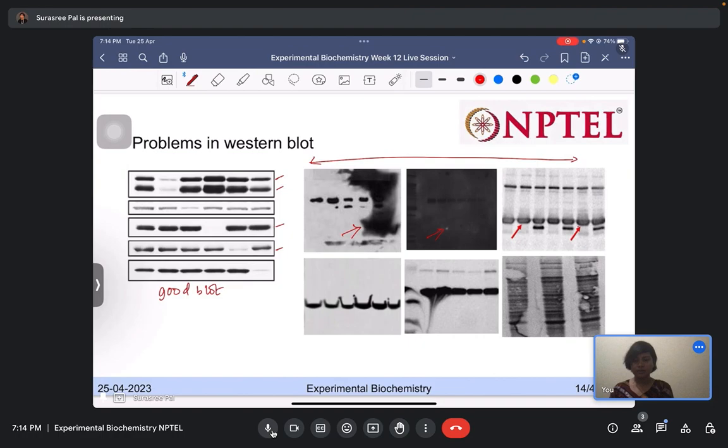These bands indicated with these arrows are ghost bands. You can see that there is a dark outer line of the band, and in between the band is white, not like this, right? These bands are called ghost bands.